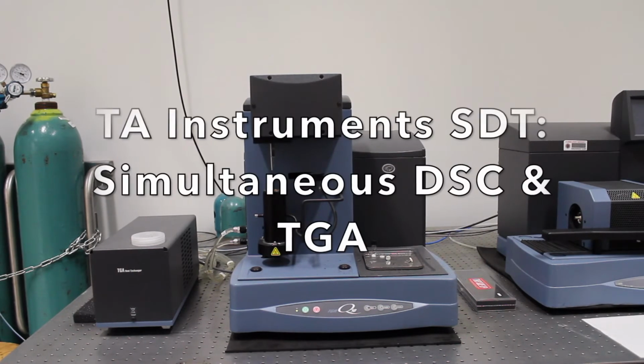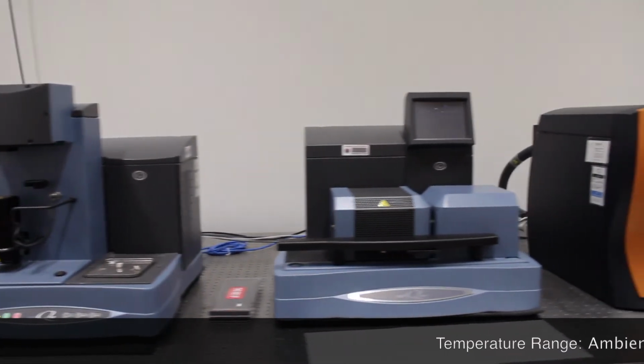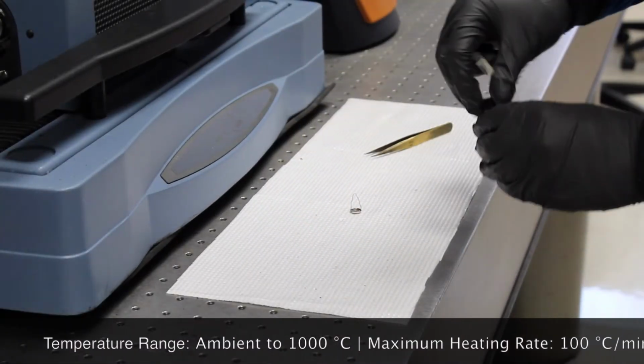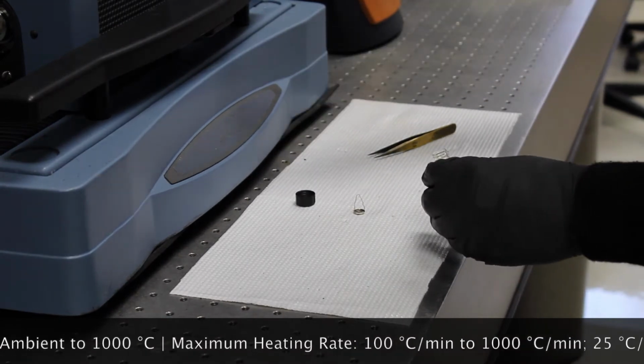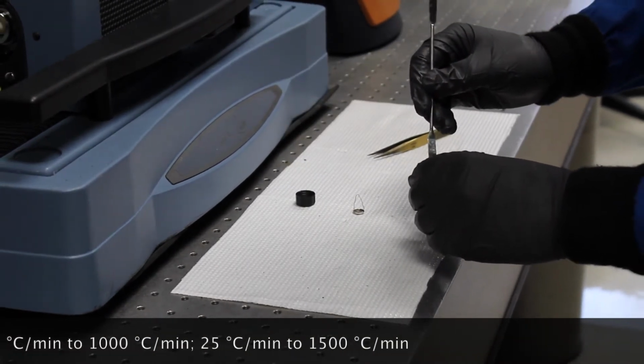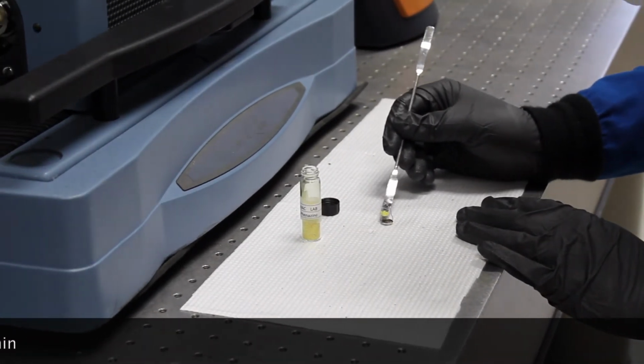In addition to the standalone TGA, the MAC Lab also has a combined DSC and TGA. This instrument is capable of simultaneously collecting both differential scanning calorimetry data, which indicate phase transitions, and thermogravimetric analysis data, which indicate the decomposition process. DSC and TGA are both used extensively in polymer chemistry.